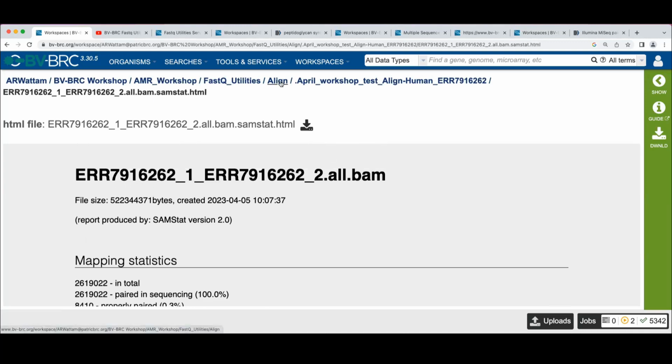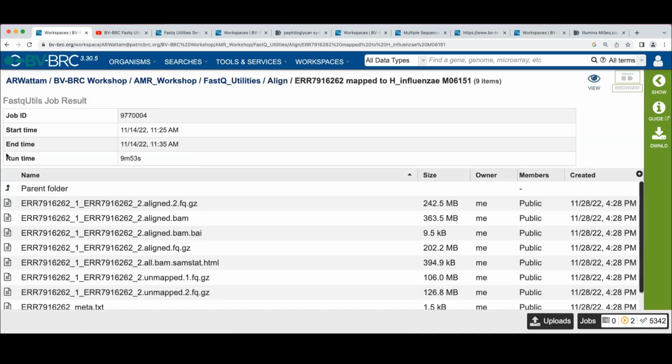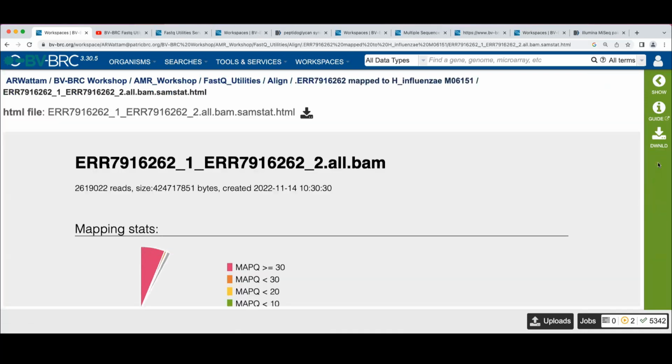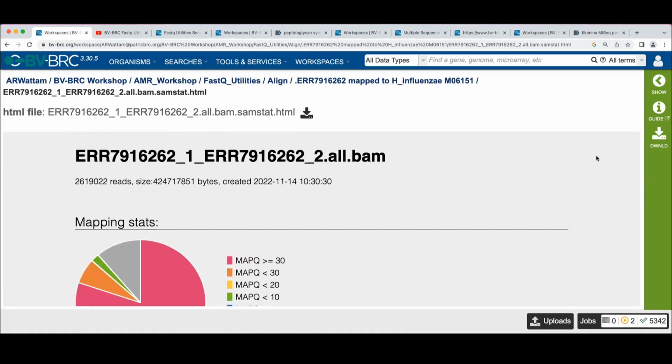I can show you what it used to look like in the glorious days before they messed with it. So this is the one that's mapped to the Haemophilus influenzae genome. Oh, look at that. Isn't that just the most adorable thing you've ever seen? But they decided that everybody would rather see the boring table than the interactive feature. I just loved that thing.